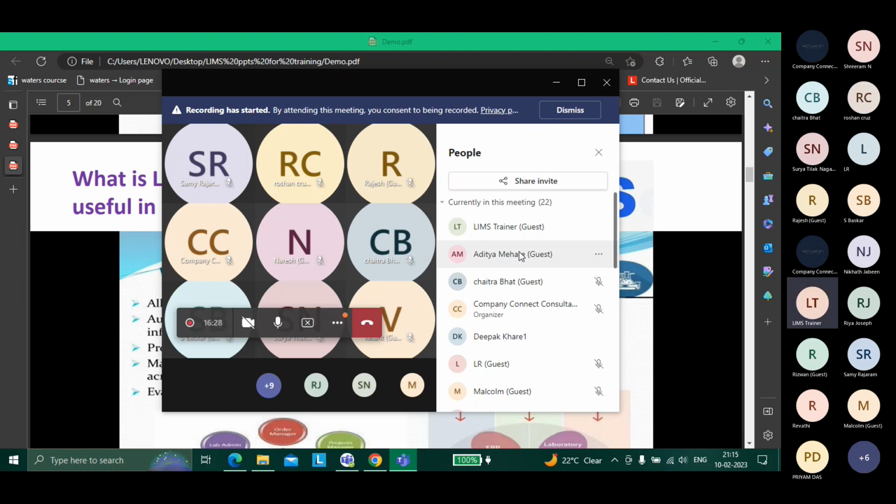Yeah, we can write queries, we can pull the sample details, we can pull user details, we can write code to automate things. Yeah, we can do that. But coming to the very basics, what do we do? What is LIMS? This is what LIMS is. It's clear, right? To all of you. Going ahead, if anyone asks you what LIMS is, just define it in short. I believe this would be the best definition.